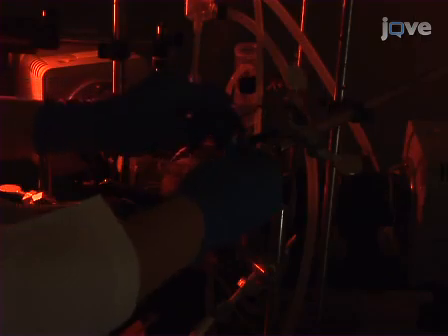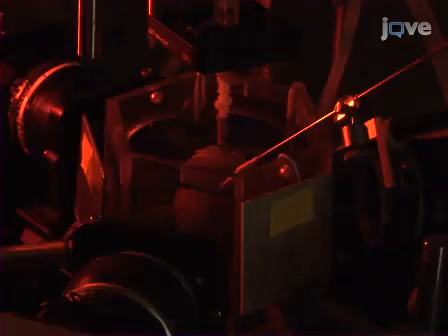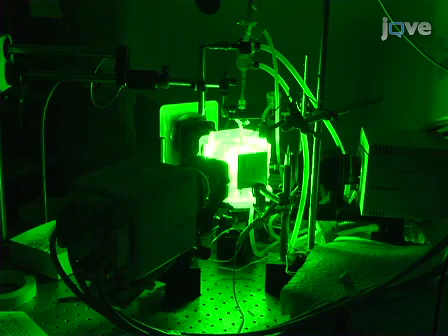Next, gently place the pacing electrode onto the desired location. Here, it is placed at the center of the anterior view of the heart. Begin making simultaneous optical recording from the PDAs.